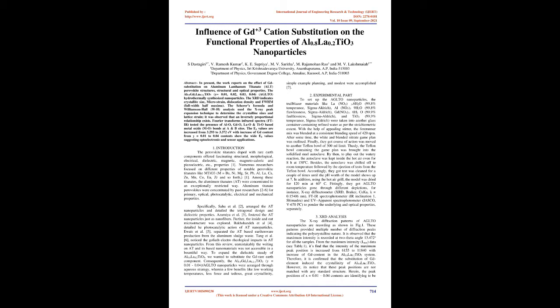Hydrothermally synthesized nanoparticles. The XRD indicates crystallite size, microstrain, dislocation density, and FWHM, full width at half maxima. The Scherrer formula and Williamson-Hall, WH, analysis used the X-ray peak expansion technique to determine the crystallite sizes and lattice strain. It was observed that an inversely proportional relationship exists.